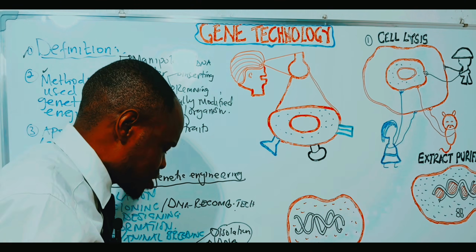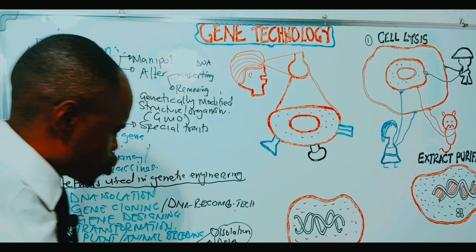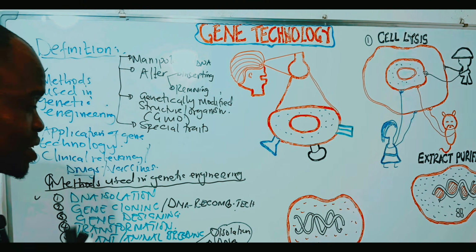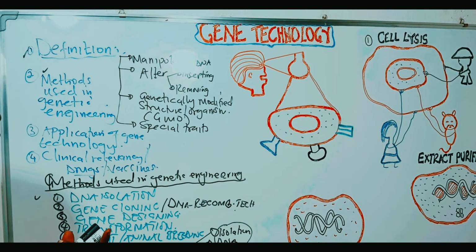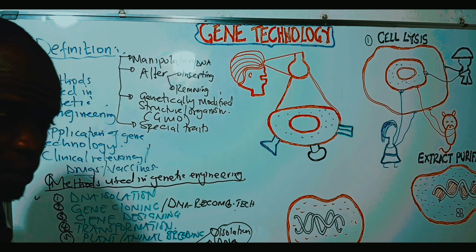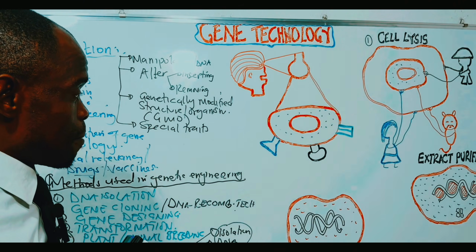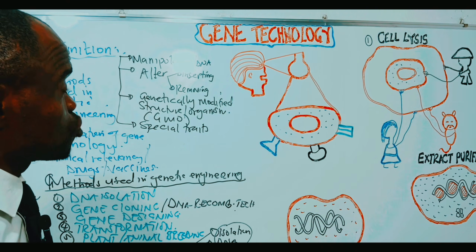Based on these, members, we're going to look at how DNA isolation takes place majorly.